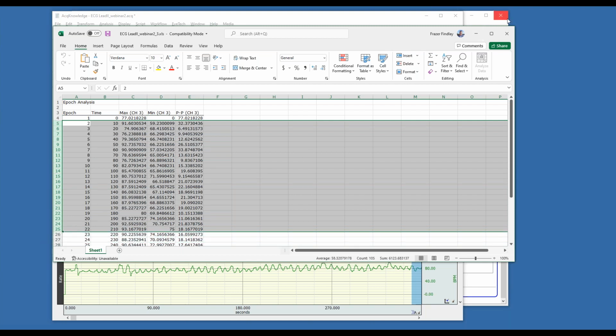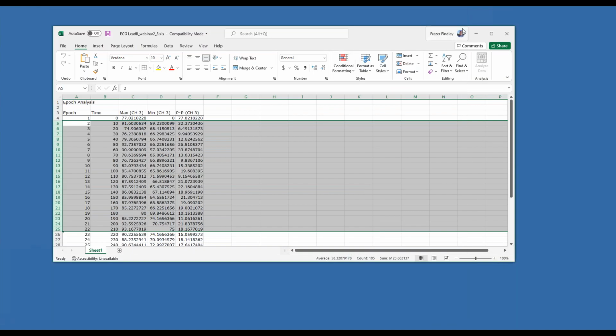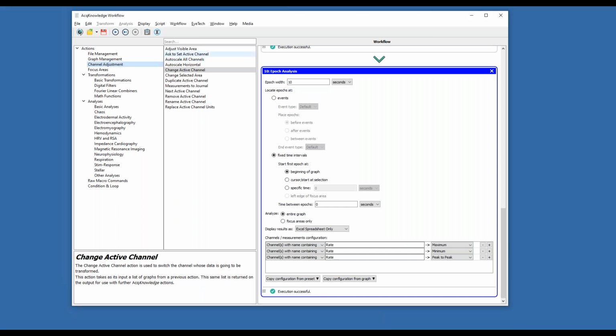So, okay, now we've layered on a little bit more. It just shut my workflow. Okay, so now we've reached this point where we're starting to layer on a little bit of sophistication. So before we get too deep and to give everyone a chance to take a breather, I'm going to hand over to Brenda for our second poll of the day.